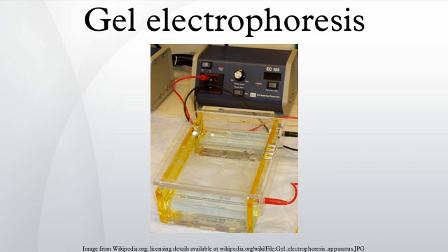Polyacrylamide. Polyacrylamide gel electrophoresis is used for separating proteins ranging in size from 5 to 2000 kDa due to the uniform pore size provided by the polyacrylamide gel. Pore size is controlled by modulating the concentrations of acrylamide and bisacrylamide powder used in creating a gel.